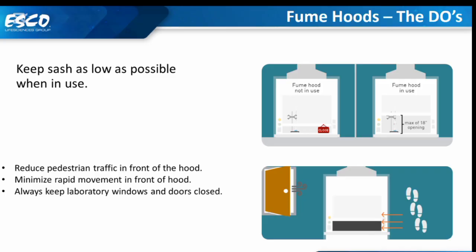So this do is important, because if you don't do it like this, then it can really affect the airflow of the unit, and vapors and fumes might escape in the lab, contaminating the operators.